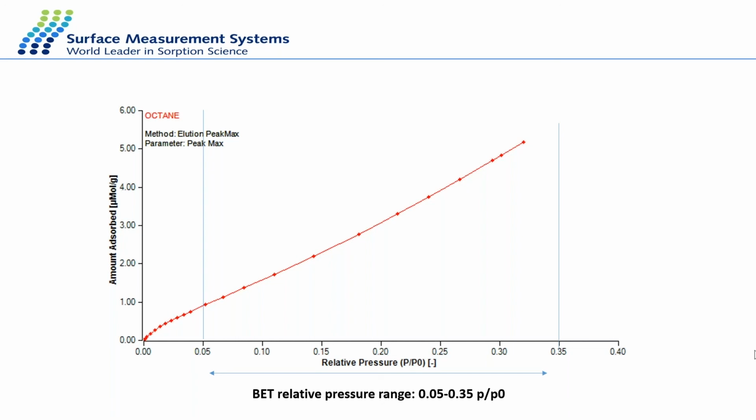But you can try to increase the temperature, maybe because the temperature is just not high enough, or you have to put more energy into the system to desorb the probes. So you can first try to apply a higher temperature, maybe because the desorption is much slower, so it requires more energy.